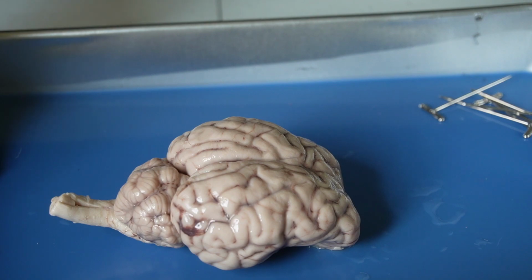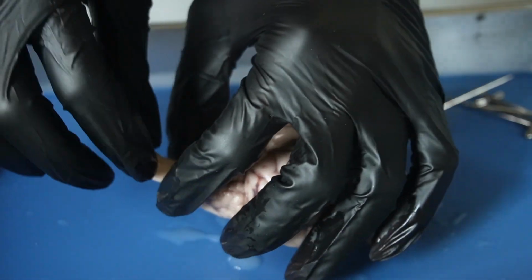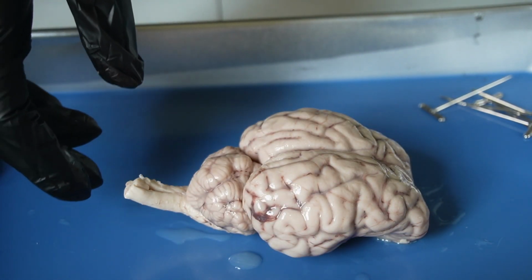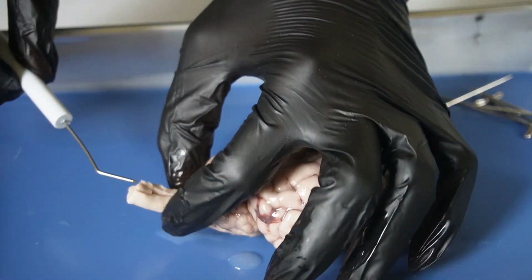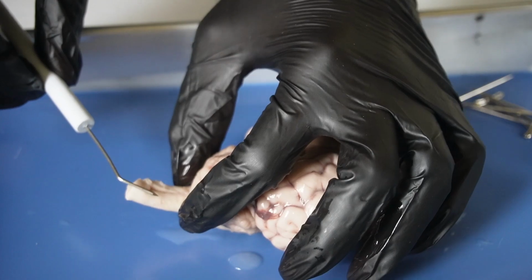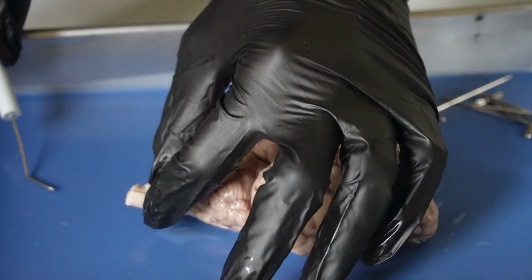Okay, so now I can, well, actually, before I continue, the next brain location is the spinal cord, which is the bottommost part of the brain stem underneath the medulla oblongata and the pons.